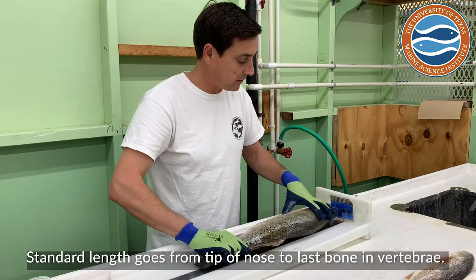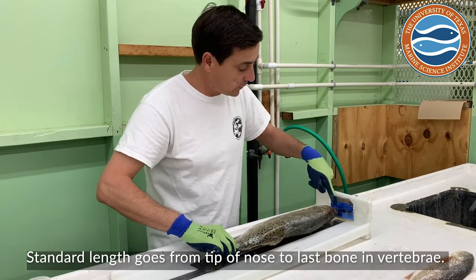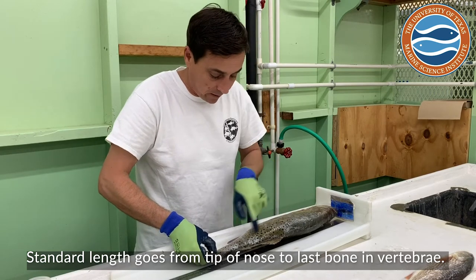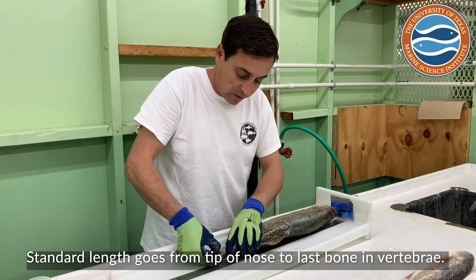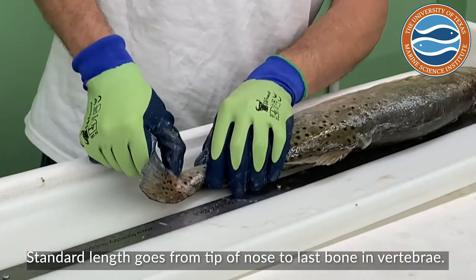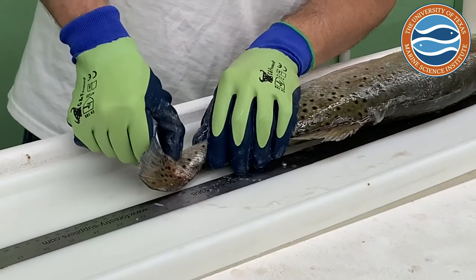The standard length essentially goes from the tip of the nose to the last bone in their vertebrae. You can feel it — if you bend it you can kind of pinch there with your finger and feel where it ends. It's basically where this little tail bends right here. That's standard length.